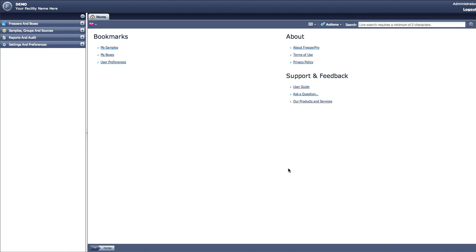To review, user preferences are changed on a per-user basis respective to each user's account. User preferences are changed in the Actions menu. Users may change country settings, page settings, barcode printer profiles, and the after login operation settings, as well as change their password in the User Preferences window.